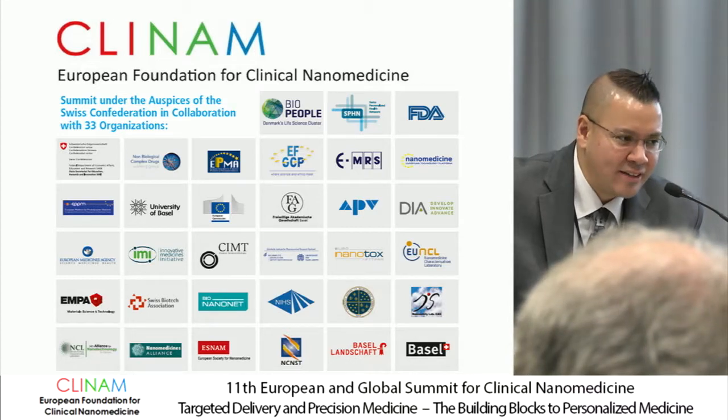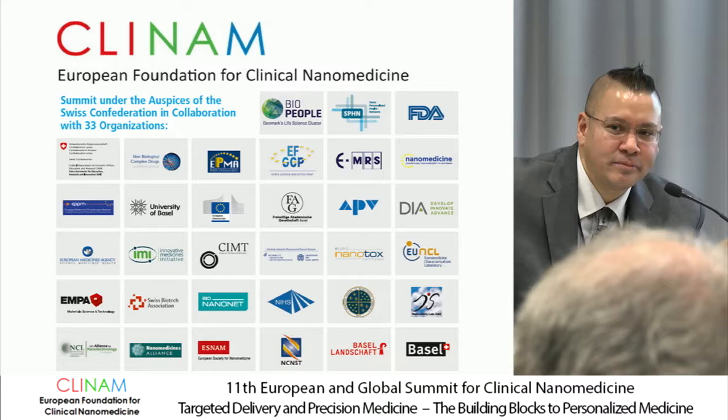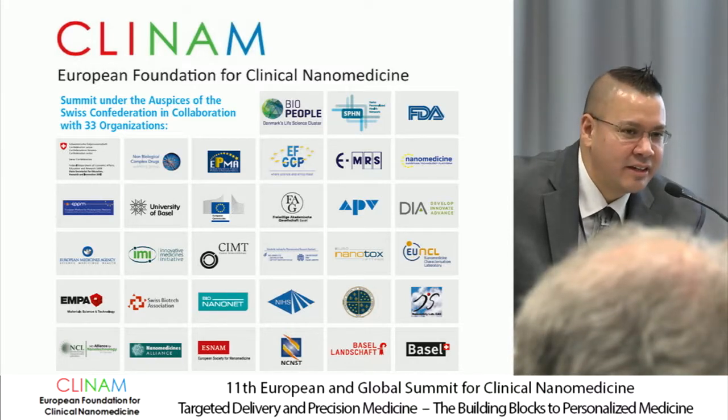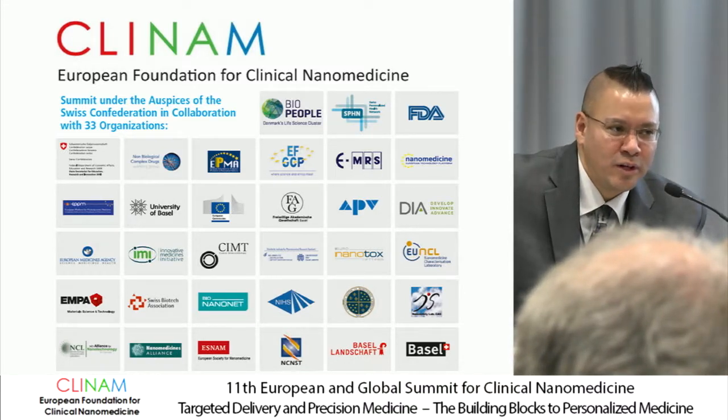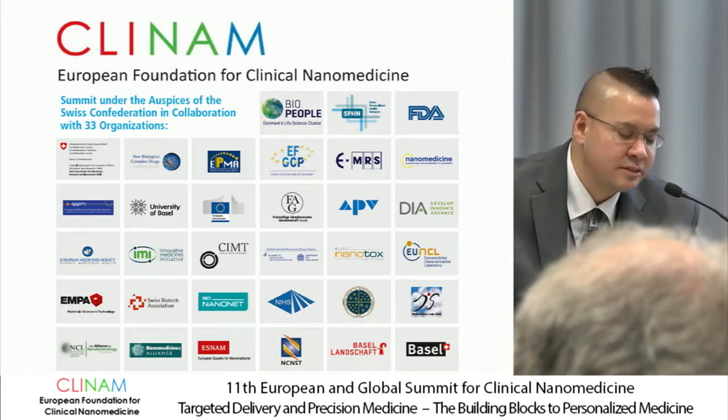Again, I just go back to that, I hark on that whole thing. It needs to relate back to some biological outcome. Reporting a size and then saying, yeah, it looks fine, but it has no meaning in a biological context, doesn't mean anything. So you want to always link those two together, and I think that's very important when reporting size.